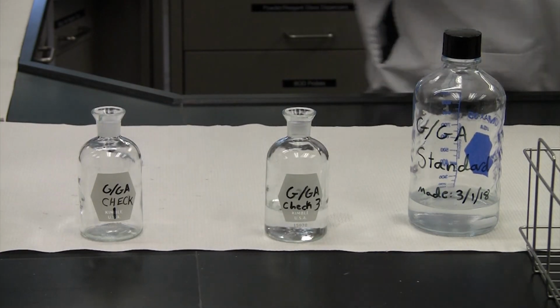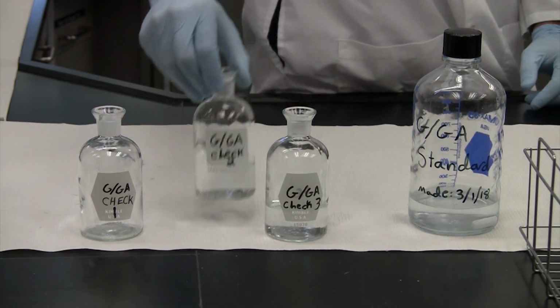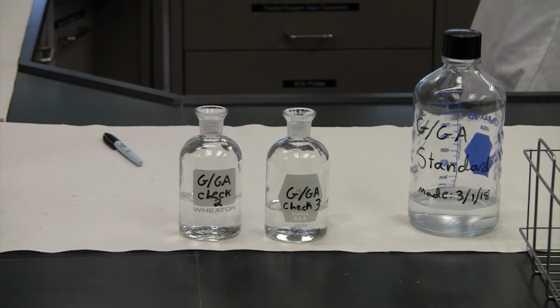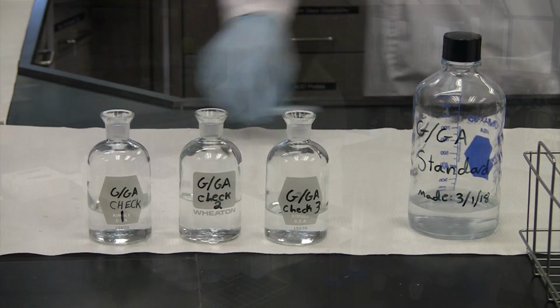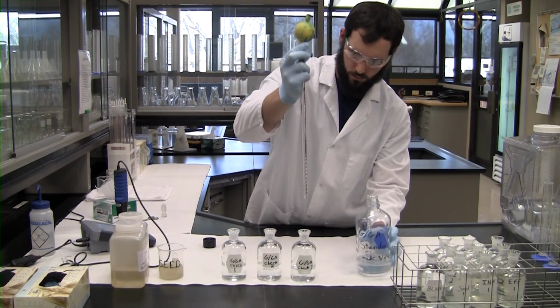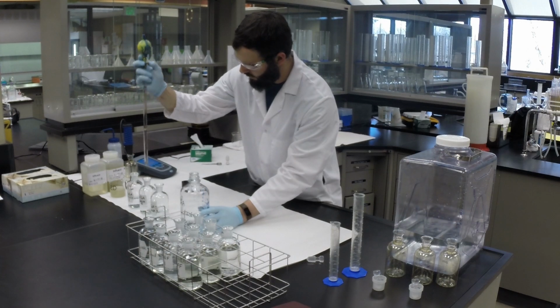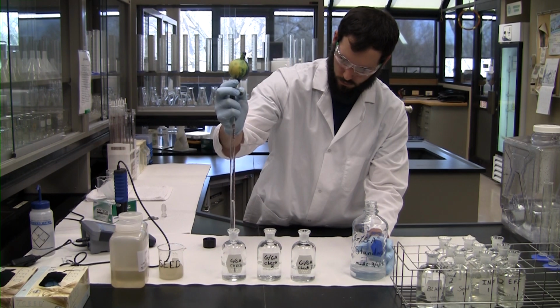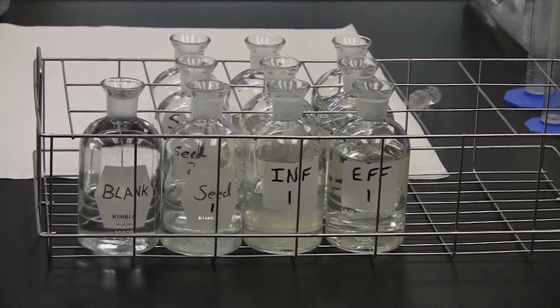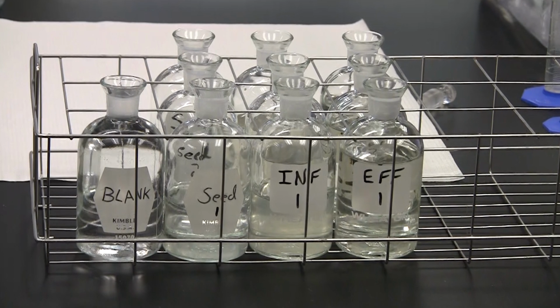Glucose glutamic acid, known as GGA standard, is a universally accepted QC check standard for BOD. GGA standard can be purchased from a chemical supplier or can be made using dry reagents. You should have 3 bottles for GGA standard checks. Add 6 milliliters of the GGA standard to each GGA standard bottle. The blank, seed, and GGA check bottles are your 3 QC checks each time you run BOD.